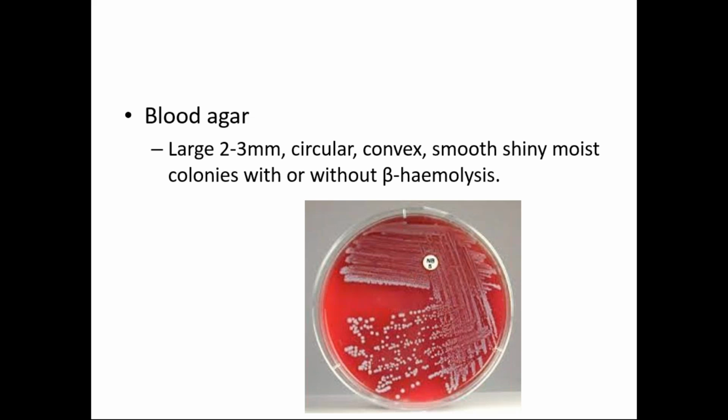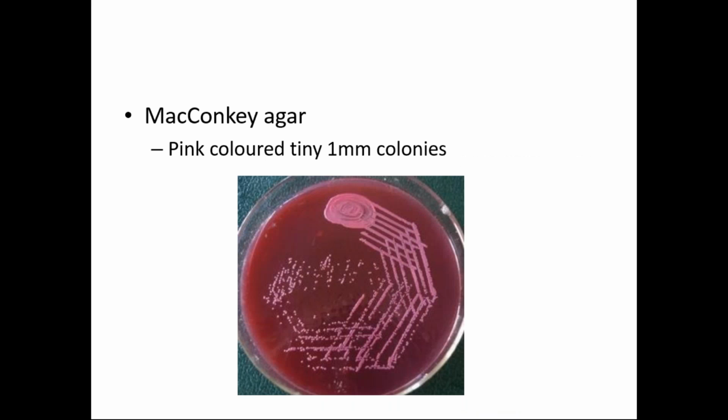Can you see this plate? Are they hemolytic or non-hemolytic? This is non-hemolytic, whereas hemolytic colonies may also be produced by some strains of Staphylococcus. Next, MacConkey agar: pink colored tiny 1 mm colonies.